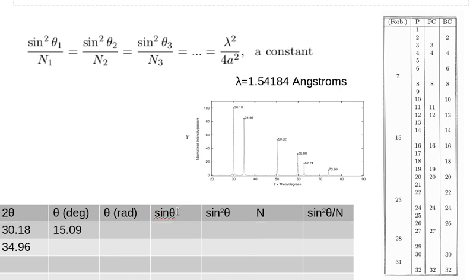Sine of 90, for example, should be exactly 1. So just check that the sine is taking the correct input and producing the correct output that you expect from it. Once you've got your 2 theta, your theta, your theta in radians and your sine of theta, you can then square it, and you will get a value of the square of the sine of theta, which we then take forward.